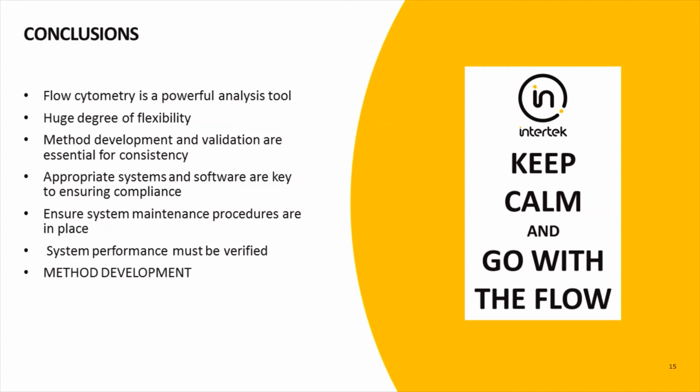So, to wrap up, I hope I've demonstrated that flow cytometry is a highly flexible and powerful tool for analysis. But of course, working in a regulatory environment, this can present its challenges. To ensure methods are fit for purpose, their application must be considered, and they must be developed to meet this criteria. Method validation should be thorough and take into account the strengths and limitations of the technique.